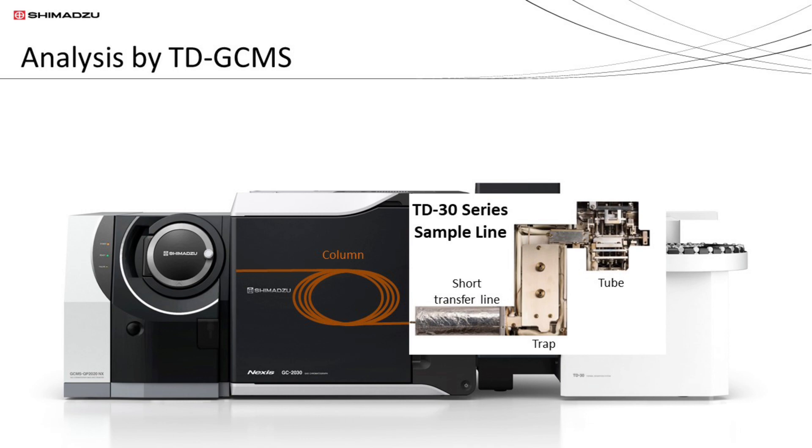Shimadzu thermal desorption system is connected to GC-MS through its short transfer line which minimizes dead volume. Additionally, the whole TD sample line, including the transfer line, can be heated with no cold points so that even highly adsorbent components can be analyzed with high sensitivity.